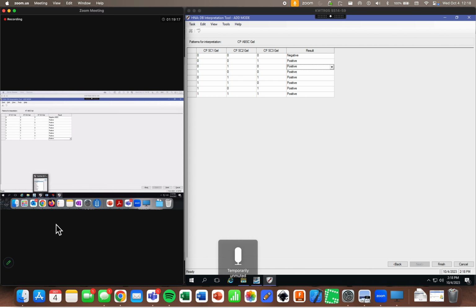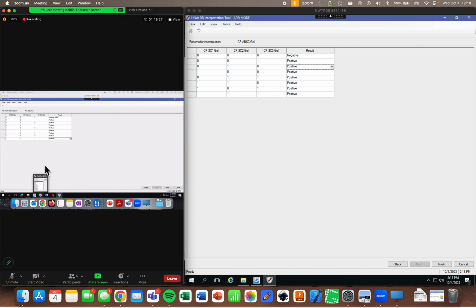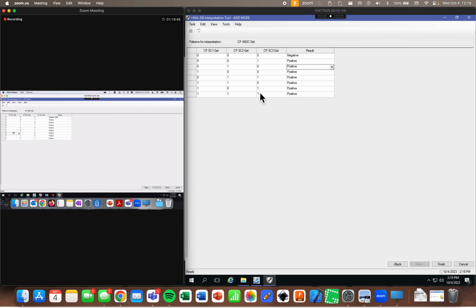So on one of those, you made a duplicate. Did I? And I'm wondering, will that cause an issue downstream? Quite possibly. Thank you for noticing that. Let's see, this should be my 101, 110, 1, 2, 3, 4, 5, 6, 7, 8, 9. Okay, which one did I miss? 0, 0, 1, 0, 0, 0, 0, 0, 1.